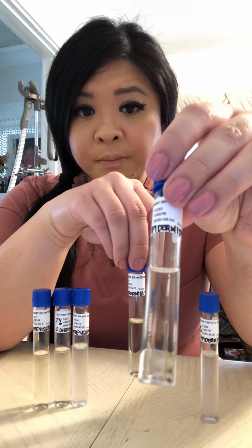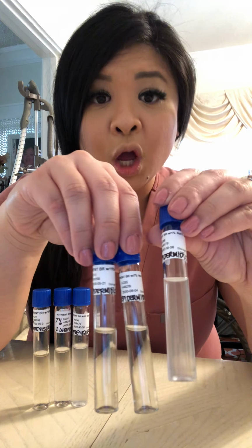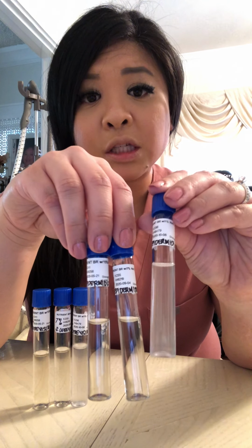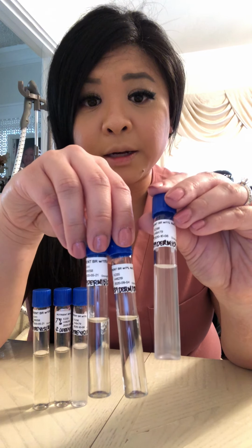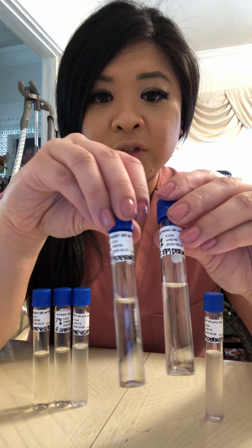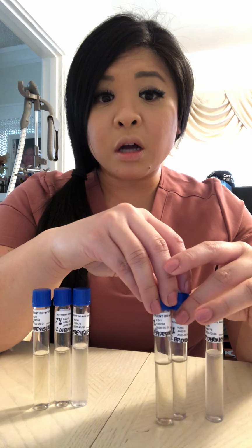For my S. epidermidis, as you can see, the 1% shows turbidity, which means that S. epidermidis tolerates low concentrations of sodium chloride. My 7% and my 15% are clear, which means they came back with negative results, meaning that they do not tolerate higher concentrations of sodium chloride.